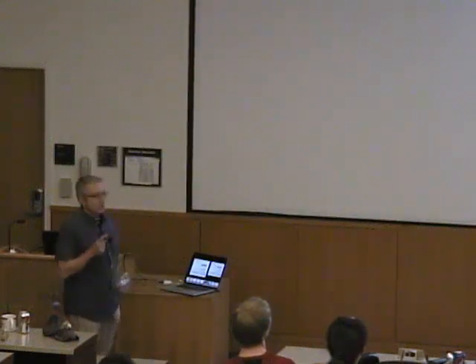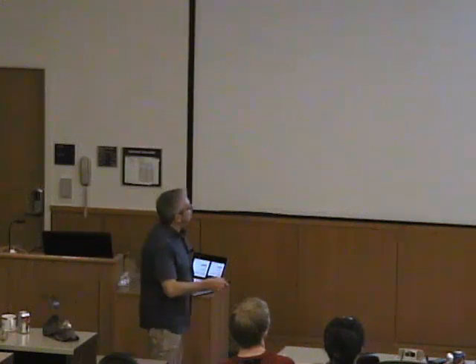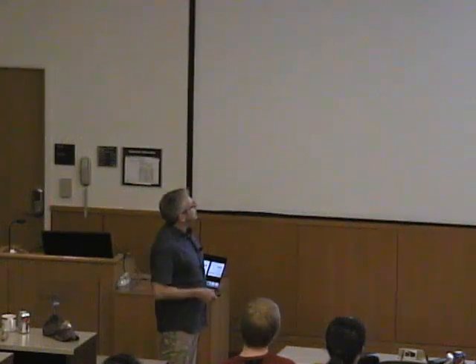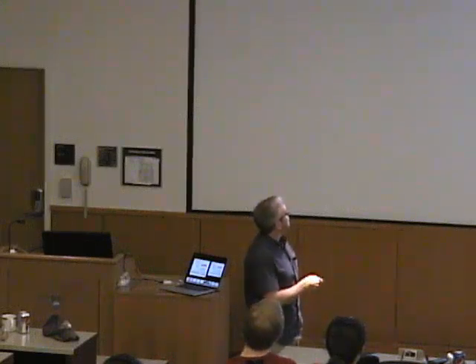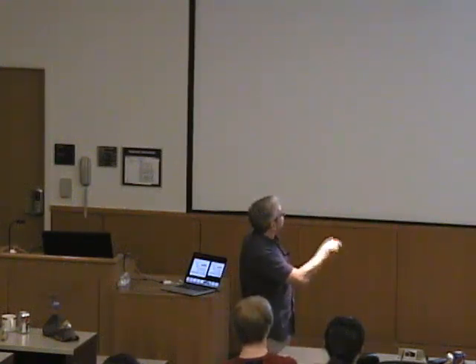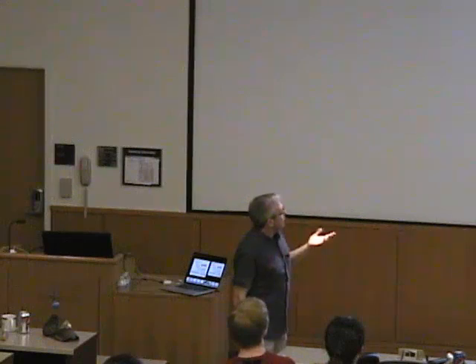So just to visualize this, let's say this is our vineyard or whatever we have. So this is in real space, axes A and B, a lattice that we're looking at. This lattice has a unit cell at some point, and then you can generate sets of lattice planes, as many as you want. You can, for example, say this is one type of lattice plane. It's always a set, they're always parallel, and they always go through all points in that lattice. And then you name them just by saying in how many parts they cut the edge of the unit cell.